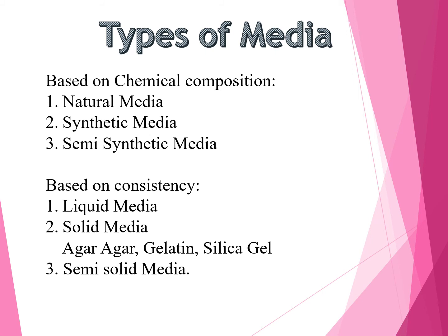They contain a solidifying agent, agar-agar, at 0.2 to 0.5% that thickens them to a custard-like consistency but does not produce a firm substrate. These are used to determine the motility of bacteria and for cultivation of microaerophilic bacteria.